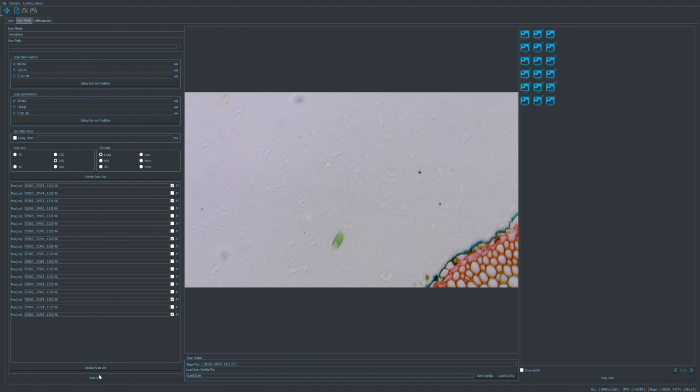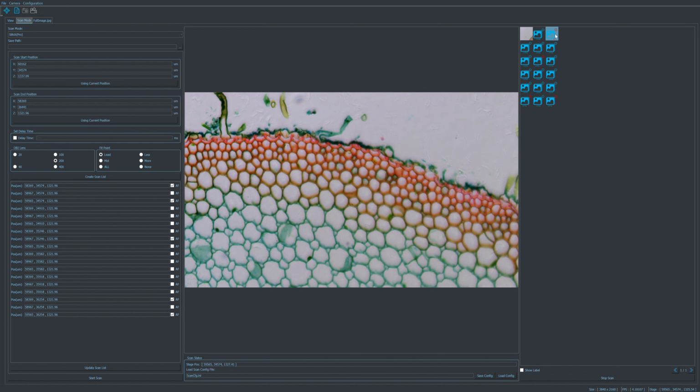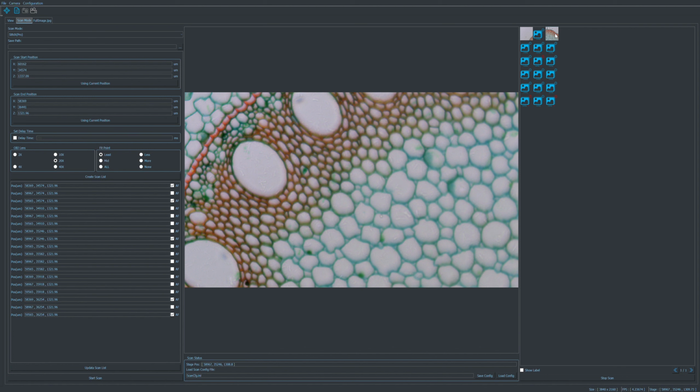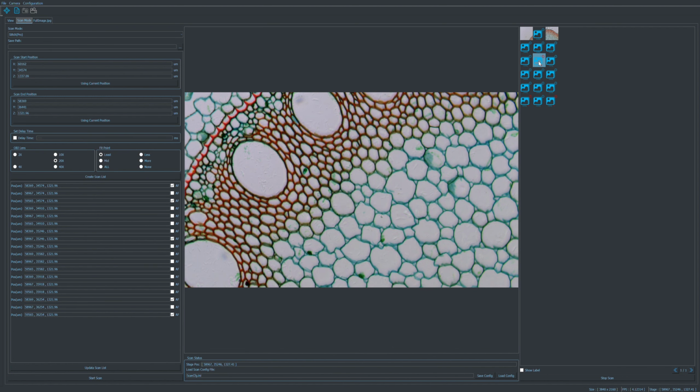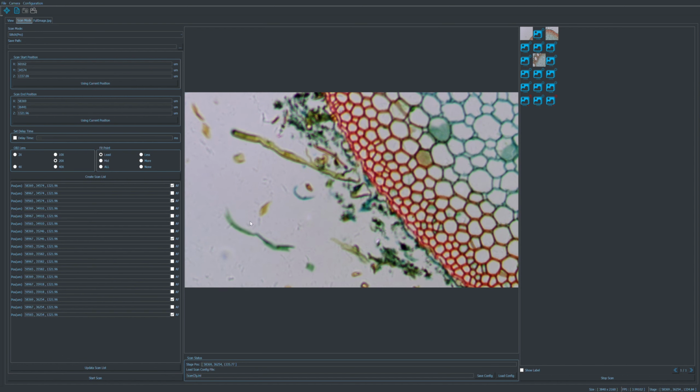So as you can see, it goes to the initial position here, which is top left from that circle I showed you, and next moves to this position, autofocus, captures, saves, and jumps to the next position you select to do the autofocusing. You can select as much as you want here, but normally it's better to choose based on what objective lens you use, how flat your sample is.